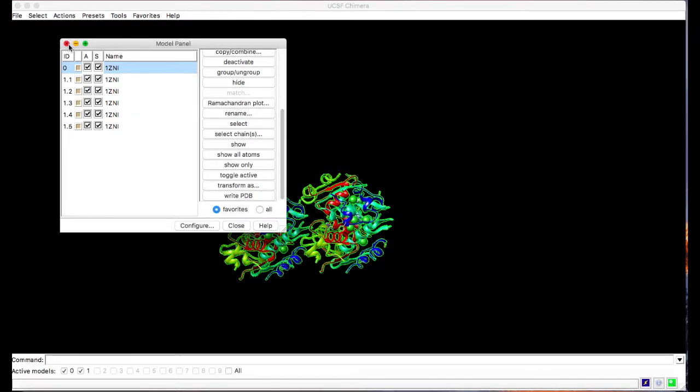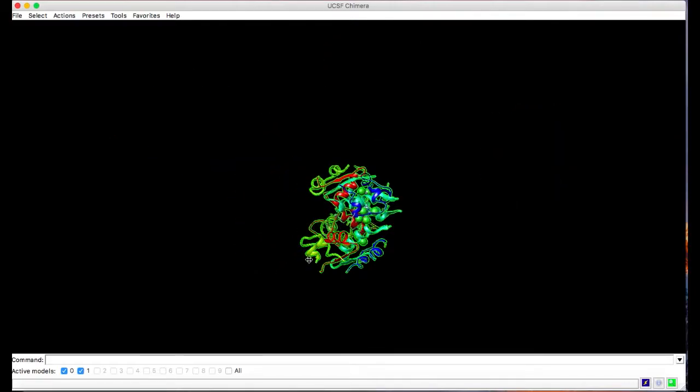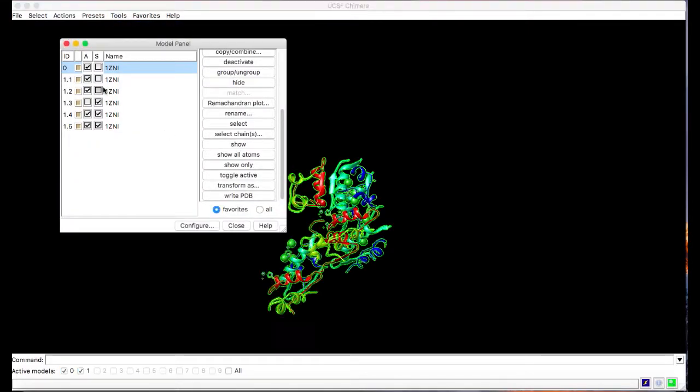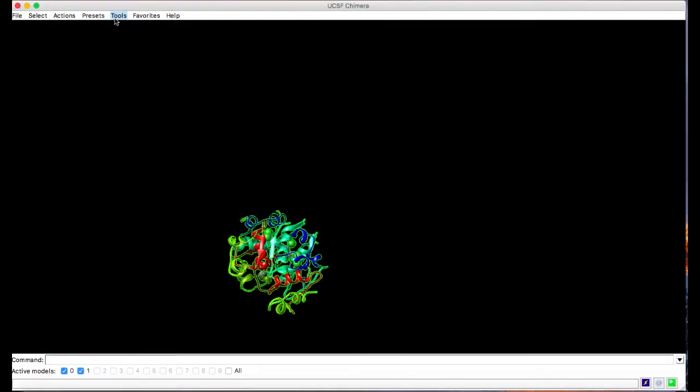Okay. So now that's for the model panel. You can hide rapidly. It's very useful if you just want to hide different structures like I'm doing right here. Okay. You can then also activate and deactivate them. So you see this is activated, but this is not activated. Okay. You can actually move it around or not. Actually being moved in all directions or not. Okay. So hopping back into our model panel and just click it or activate it and actually hide all of these because they've been moved around. So reactivate all these three. Perfect. Okay.